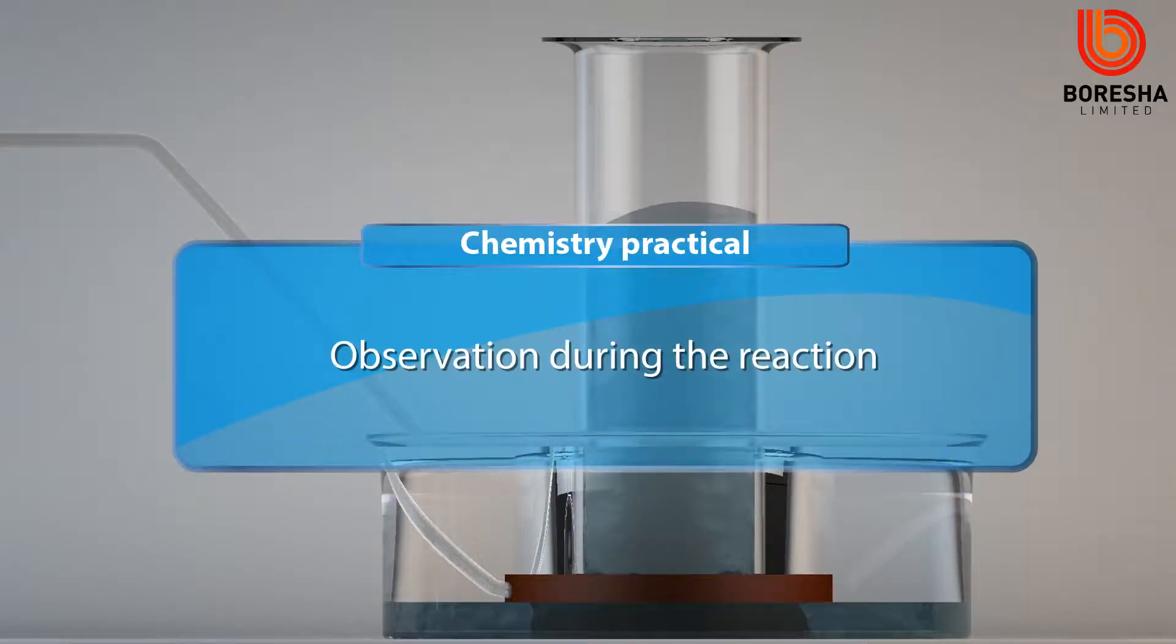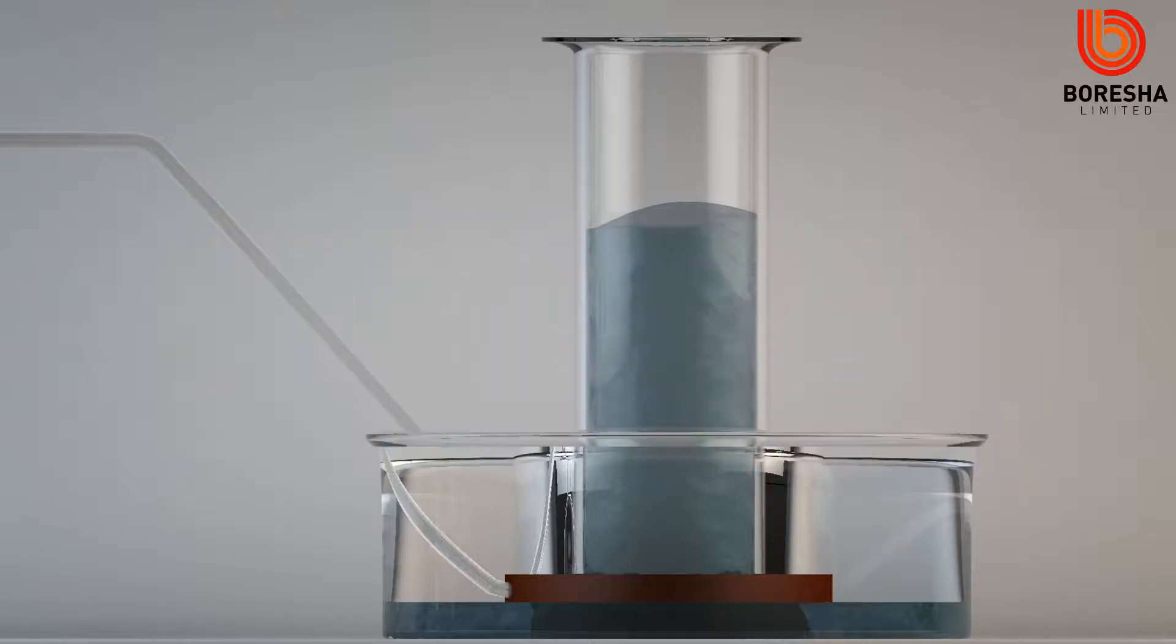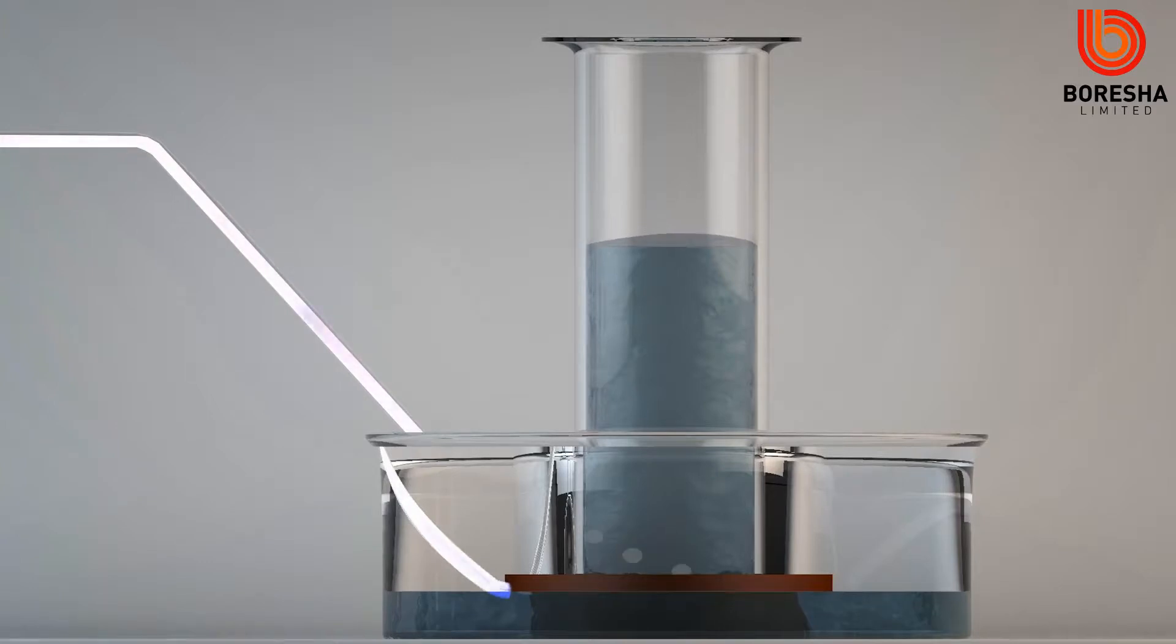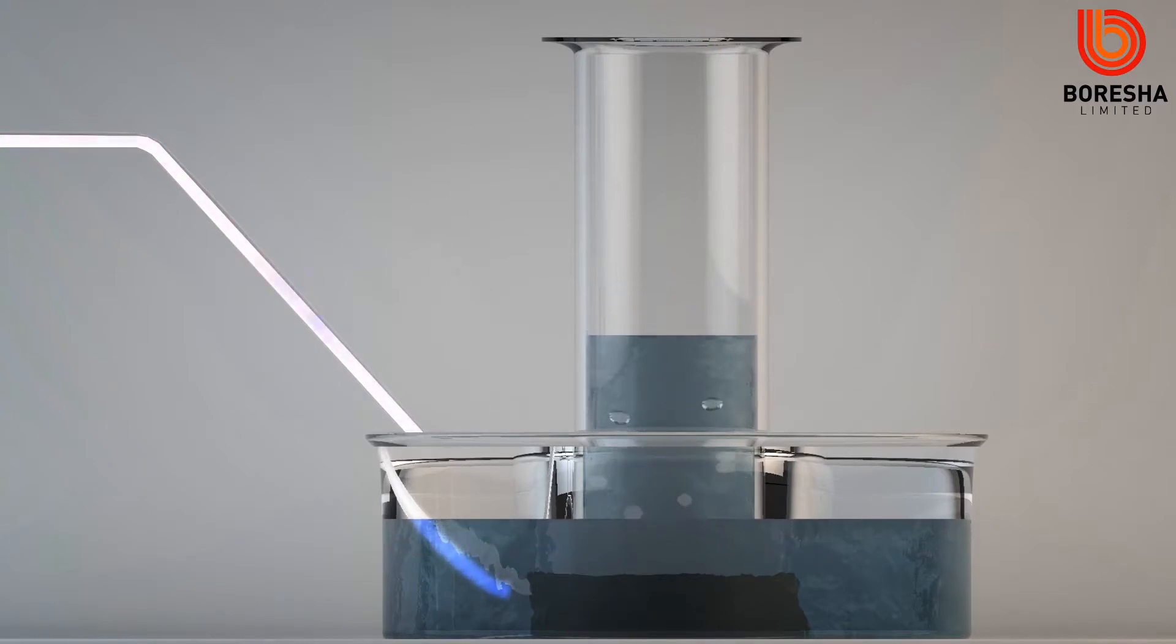Observation during the reaction: Bubbles of a colorless gas form in the collection gas jar.